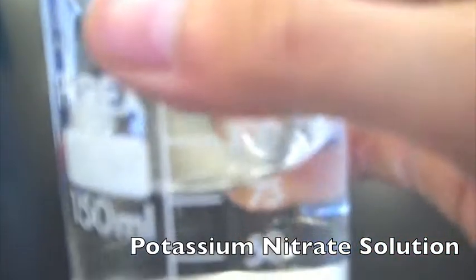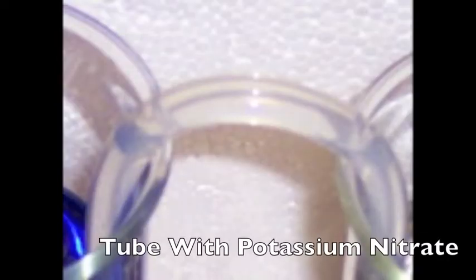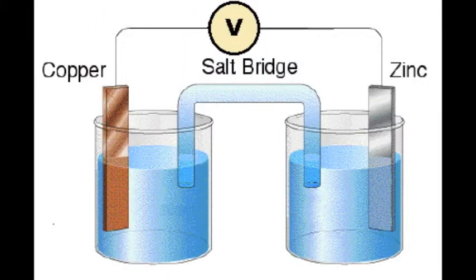Next, we had to make the potassium nitrate solution for the salt bridge, as seen here. Next, we poured potassium nitrate solution into the porous tubes and tied both ends up as the salt bridge. Next, we set up the lab according to this diagram, linking the alligator clips to the copper strip and the zinc strip, then linking the other end of the alligator clips to the voltmeter. Then we poured 140 ml of each solution into 2 beakers, as shown.